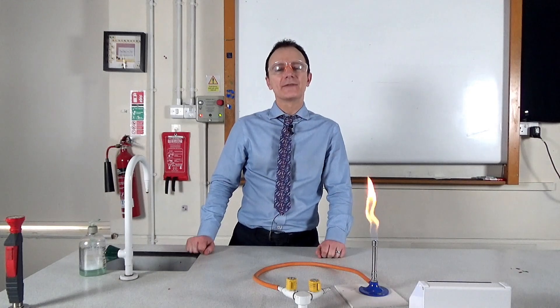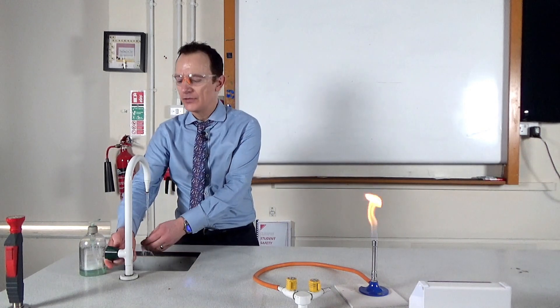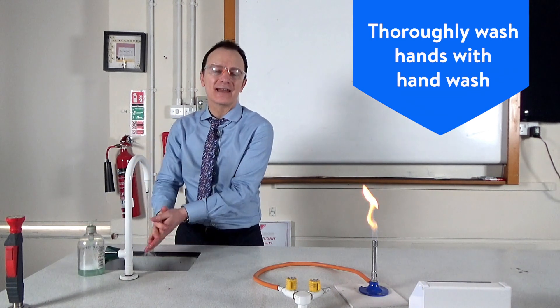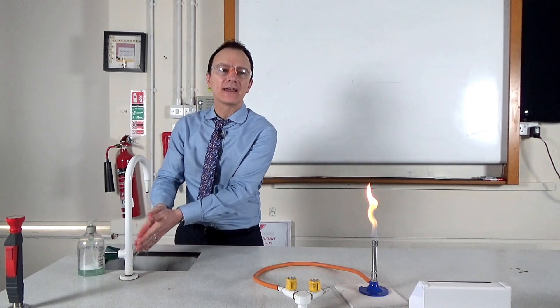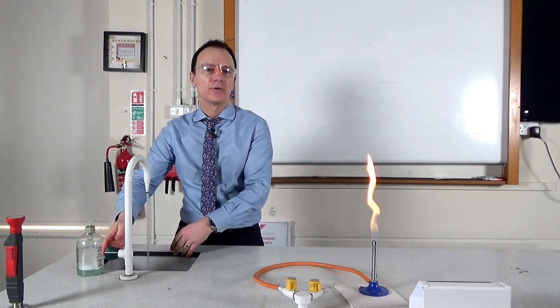Your students would then light a Bunsen burner and leave it on the safety flame. It's very important that they thoroughly wash their hands with hand wash, not hand sanitizer, because that might contain alcohol and that would present a fire hazard with the flame of the Bunsen burner.